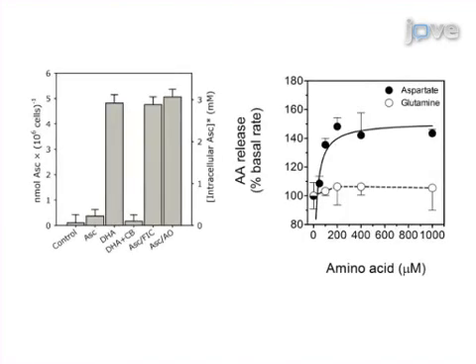The results show differences in intracellular or extracellular ascorbate levels based on the quantitative and specific reduction of extracellular iron complexes that can be detected spectrophotometrically.